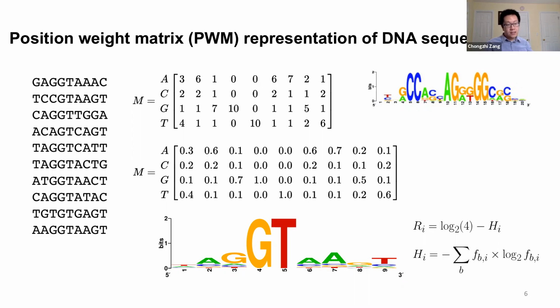And number three, we may also be able to find the DNA motifs of other transcription factors in the peak regions. That could indicate that the transcription factor we ChIPed has some cofactors.